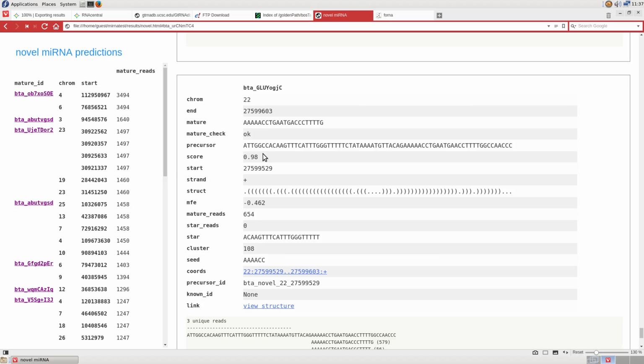And you can see that there are definitely a couple of improvements that could be made in terms of filtering and optimization for speed. And you should definitely, if you've used this program, try to use at least one other piece of software to compare the results to. There's also another program called miRReader that can do novel microRNA prediction without a reference genome. So there are other tools out there. One of the selling points of this one is hopefully that it's a bit more accessible and easier to use than some of the others. But you should definitely try more than one program.